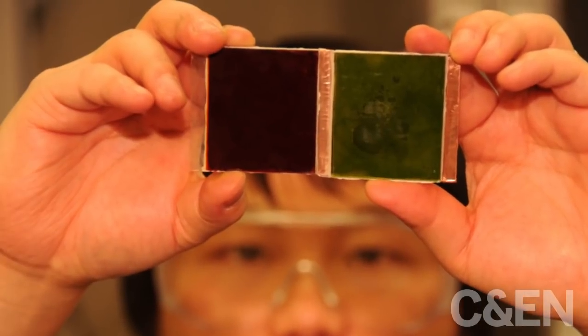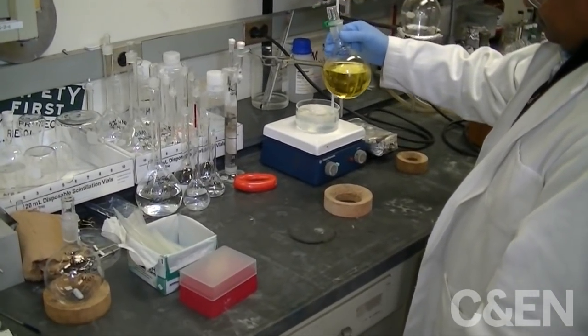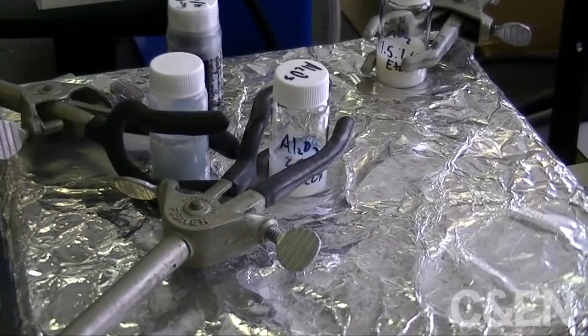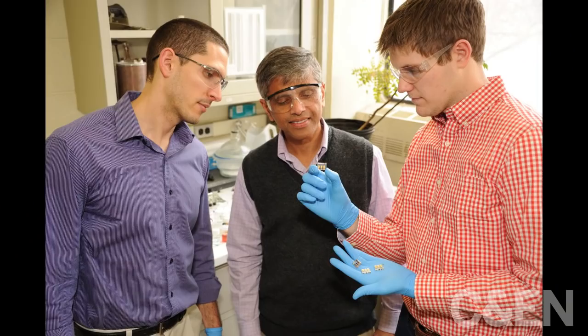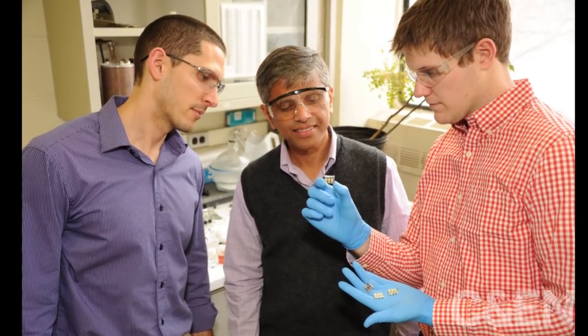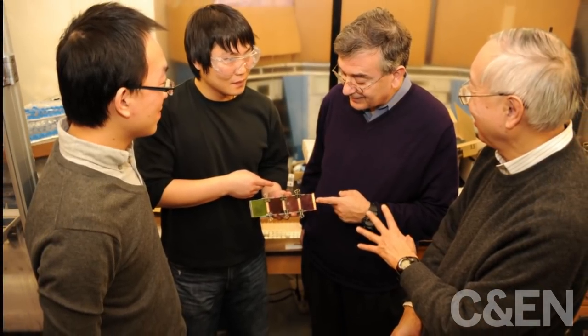They can be made simply and inexpensively by using common wet chemistry lab methods and ordinary low-cost equipment instead of the expensive deposition equipment common in the semiconductor industry. Step inside labs at Notre Dame and Northwestern universities to see some of the methods that make this process cheap and accessible.